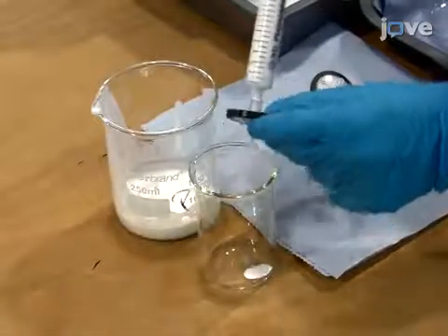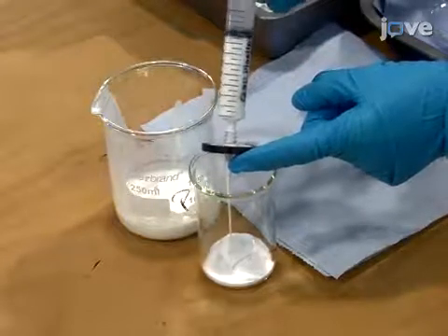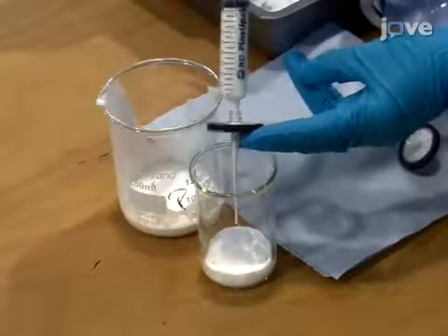Before loading the ink into the print cartridge and head, filter it through a 5 micrometer polyvinylidene fluoride filter, followed by a 1.2 micrometer filter to remove any large particulates which can clog the nozzles.